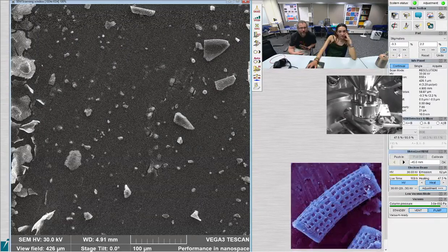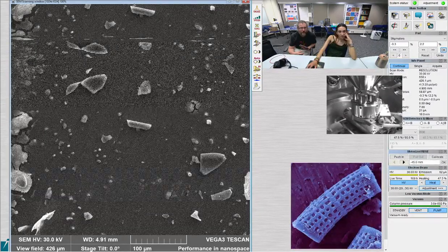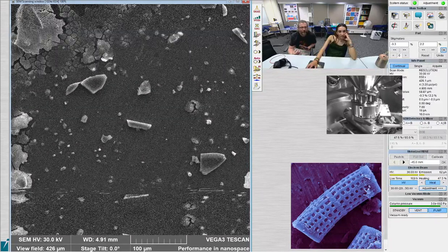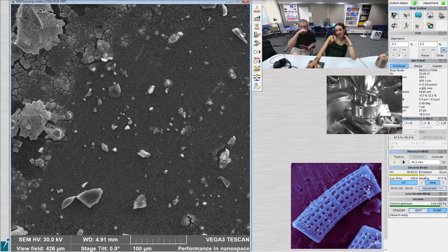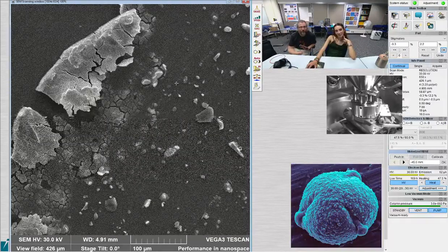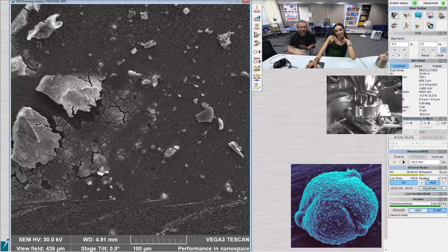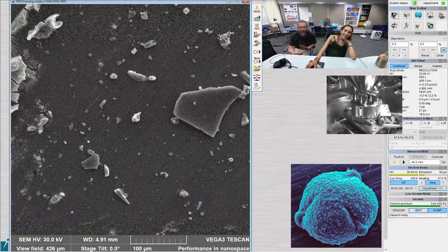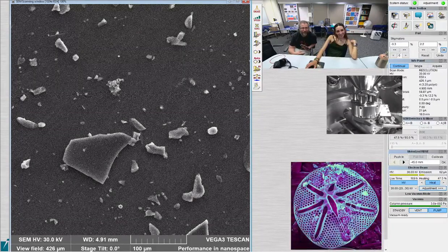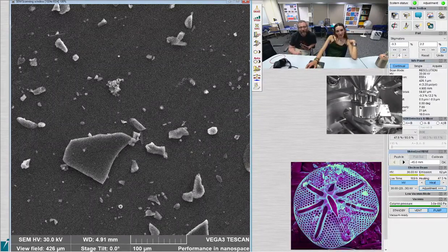And it could also be that some of the samples have more diatoms than others. Yeah, I don't know this one. You can feel free to zoom over to another stub. There's seven of them to choose from, and I don't want us to just get stuck on one. But also, I want you to have the freedom to look around, you know?